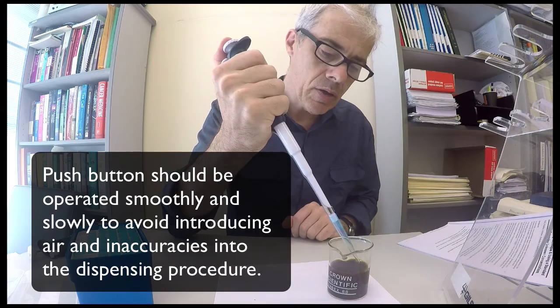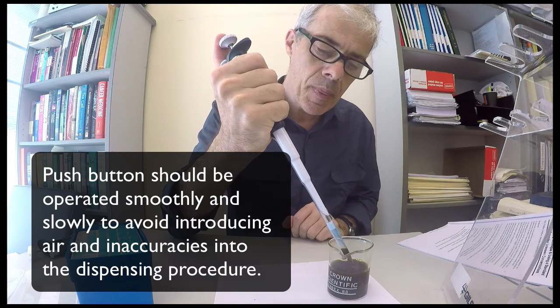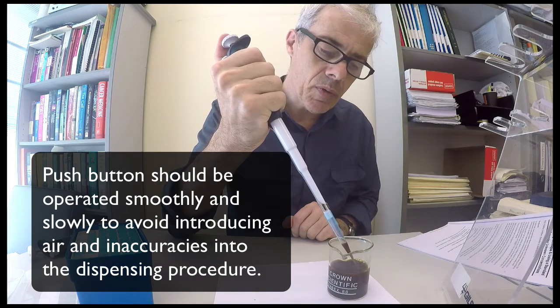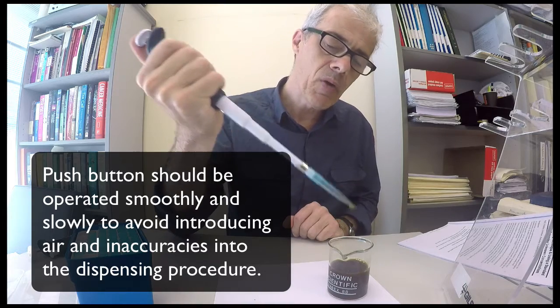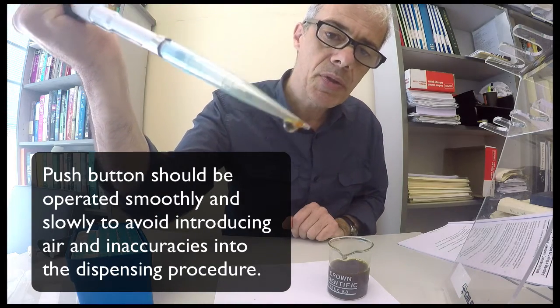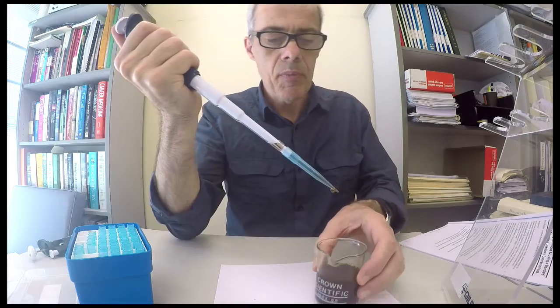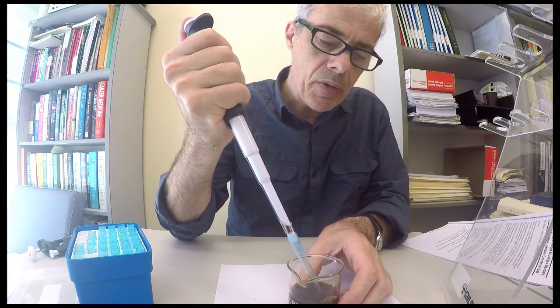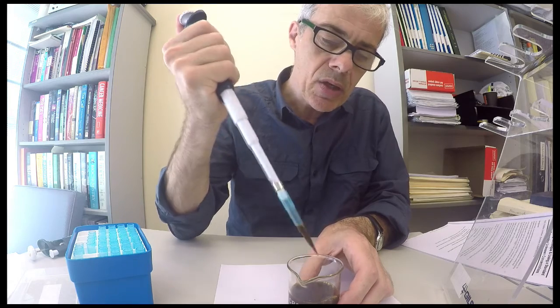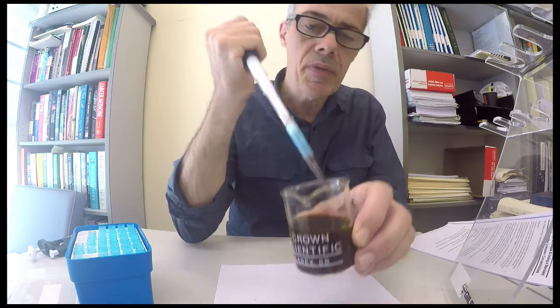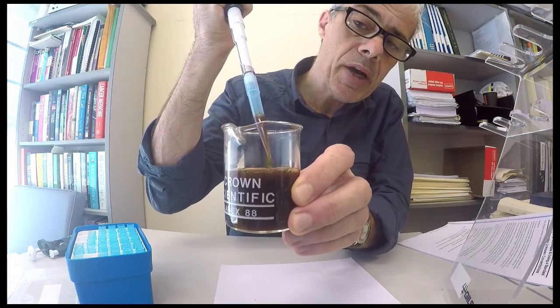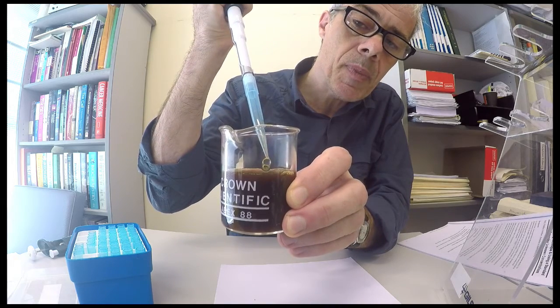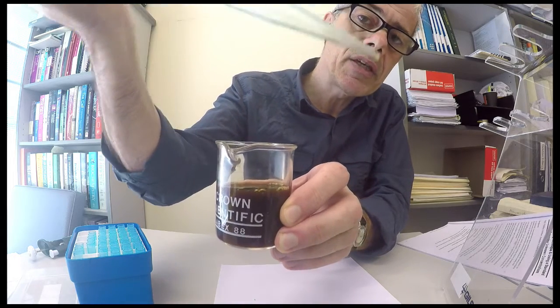And you can draw up slowly and you can be a little more firm when you're dispensing. Often you'll get bubbles on the end. Depending on what you're dispensing, I often dispense onto the side of the container and that way you tend not to get residue left in the tip.